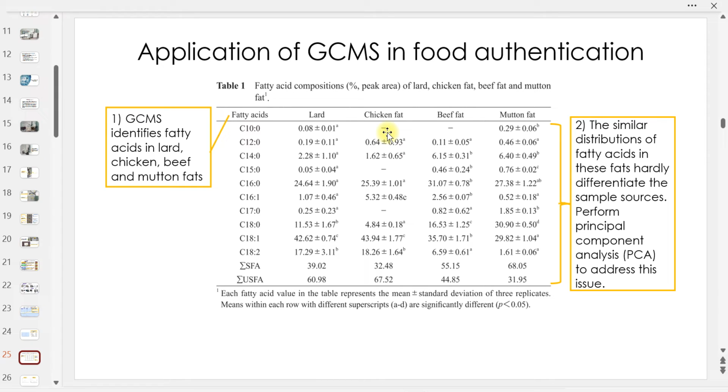Perhaps not detected, ND. You have to put 0 for chemometrics, but in reporting of thesis, ND, not detected. Yang ni macam it's not that best lah. You letak dash kan? Unless you put dash, mean what?